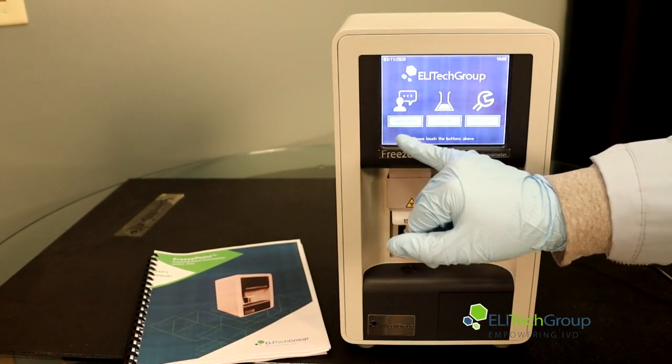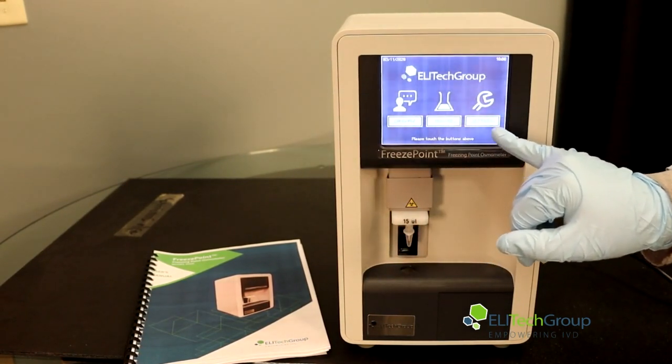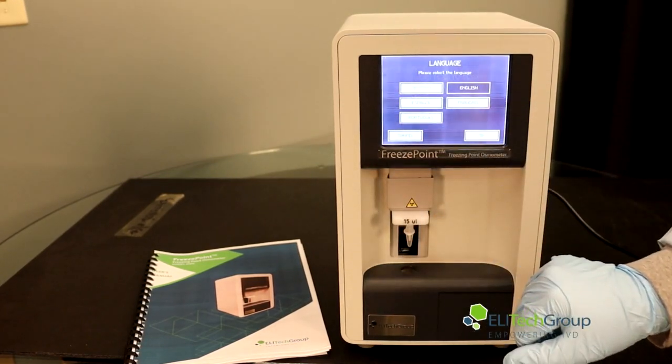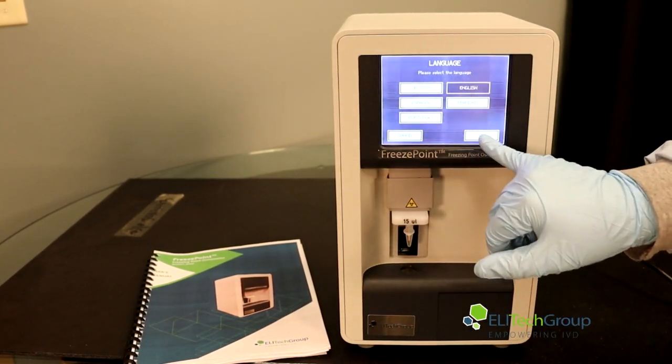This will be the home screen. Here you will have language, measure, and settings as the three options that come up. We'll go into language first — you will have five options to choose from. We're going to stay in English for this one.